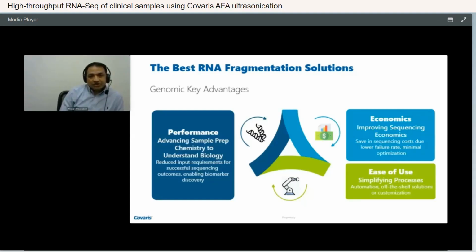One such application using AFA is for tumor transcriptomics. Earlier in this webinar, you heard from Dr. Stuart Levine.